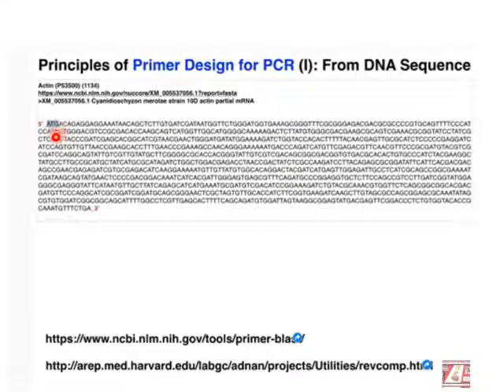If we imagine it's the mRNA, it will be AUG. So this is the start codon. And if we look down here at the end, the TGA, if we imagine the mRNA, that will be UGA, which is a stop codon. And this is the entire gene sequence for the actin.